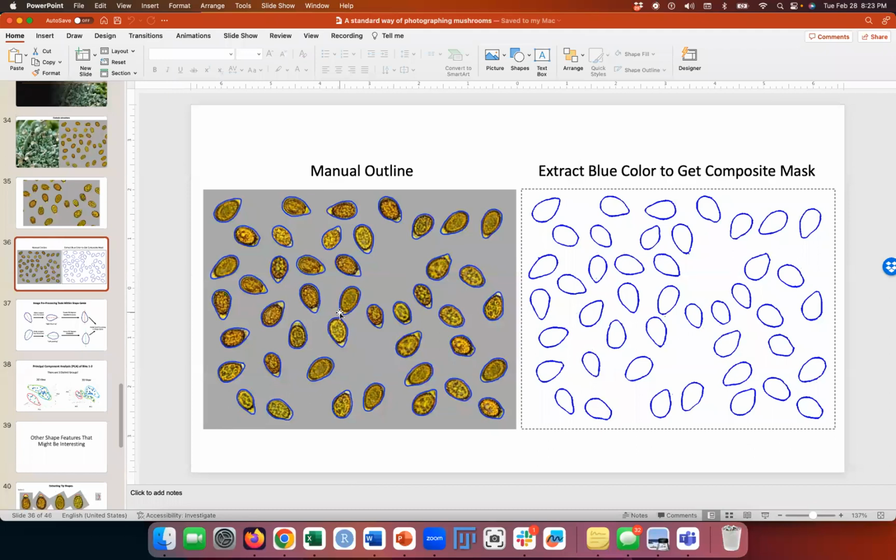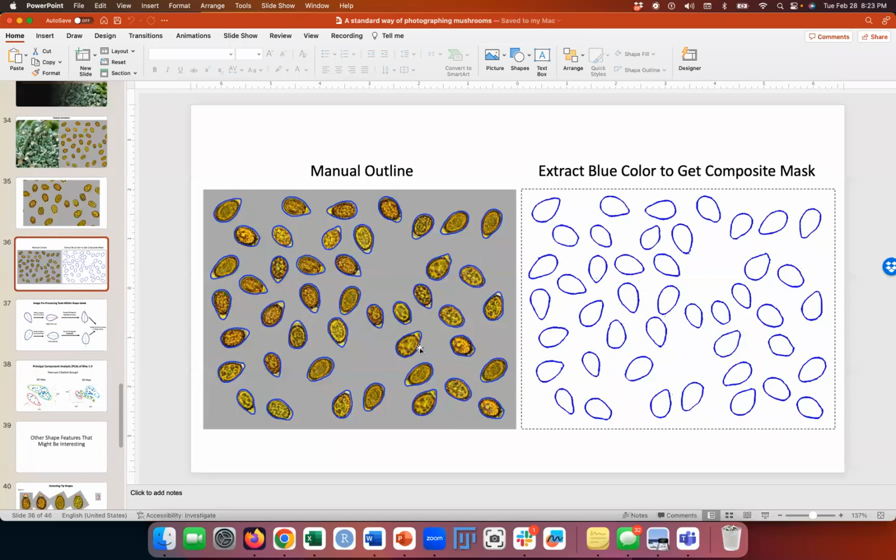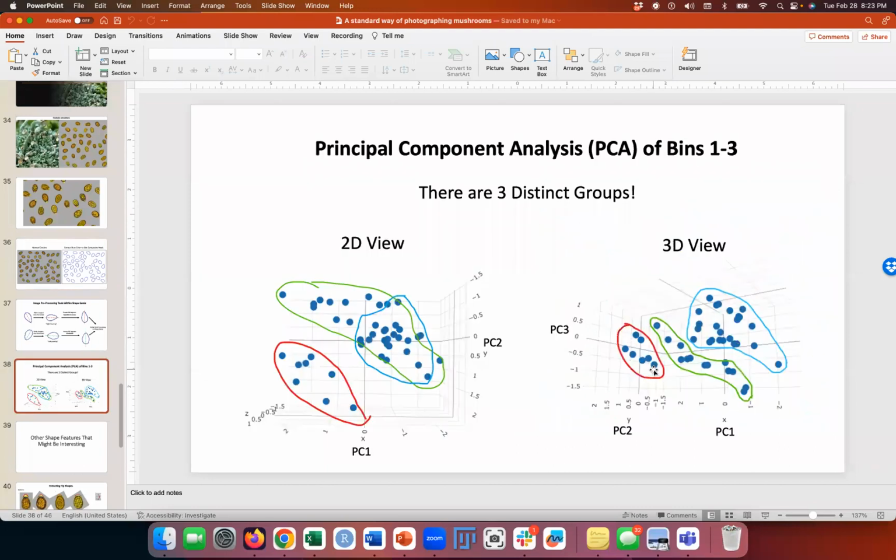this image. And to the human eye, it's very hard to pick out that there are 3 shapes because the human eye is just very bad at seeing subtle shape differences. But when you do shape analysis, this is the level of detail that you can produce, right? And so I was very surprised and happy that in something seemingly so homogeneous, right, there's actually evidence of 3 distinct morphologies, right? And that's just the shape of the outer contour of the spore.